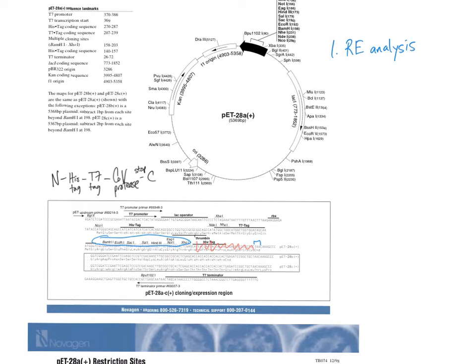There's all kinds of little sites, and you cut and paste. I don't need it to be pET28, because pET28 already gives me this multiple cloning site of restriction enzyme sites that are unique to just that part, so it doesn't cut anywhere else in the plasmid. But I would like to know about that protease. So you just cut and paste. You go up in Word.